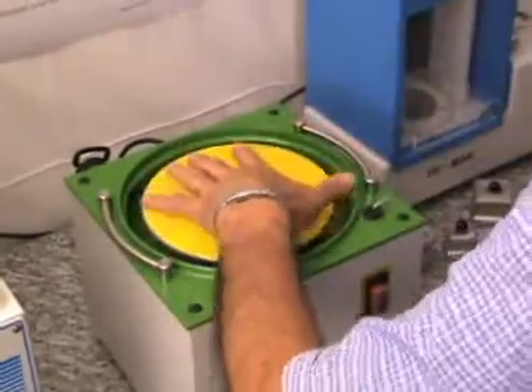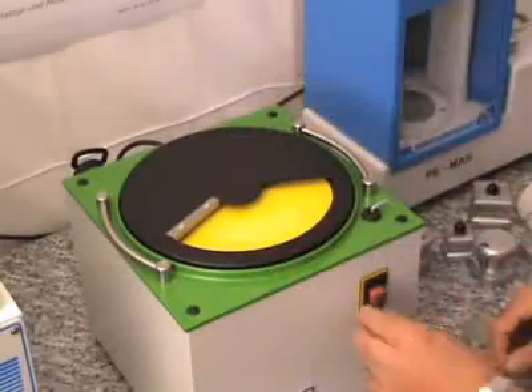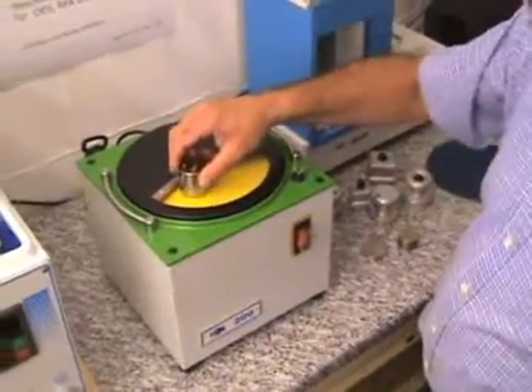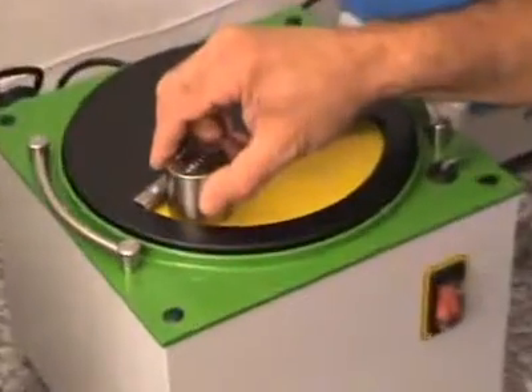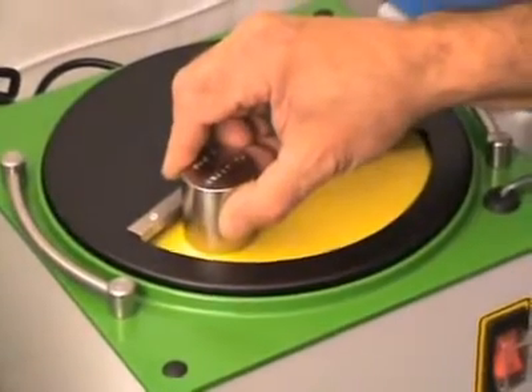The cover is placed back on the machine and the motor is started. The sample is moved horizontally on the grinding paper with little pressure only.